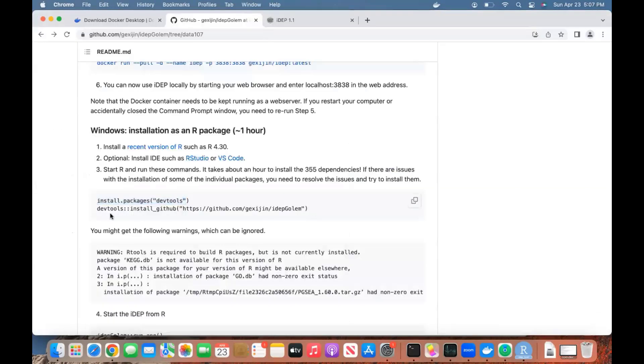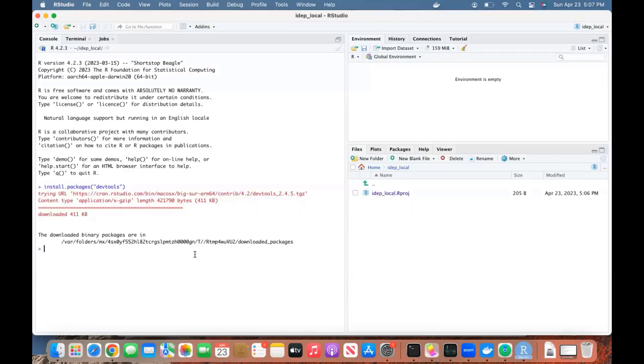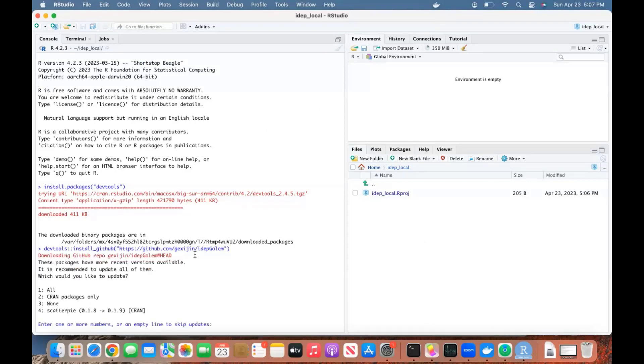Come here and install the iDEP package. This is now going to take about an hour if everything goes well, and sometimes it needs a little bit of troubleshooting.